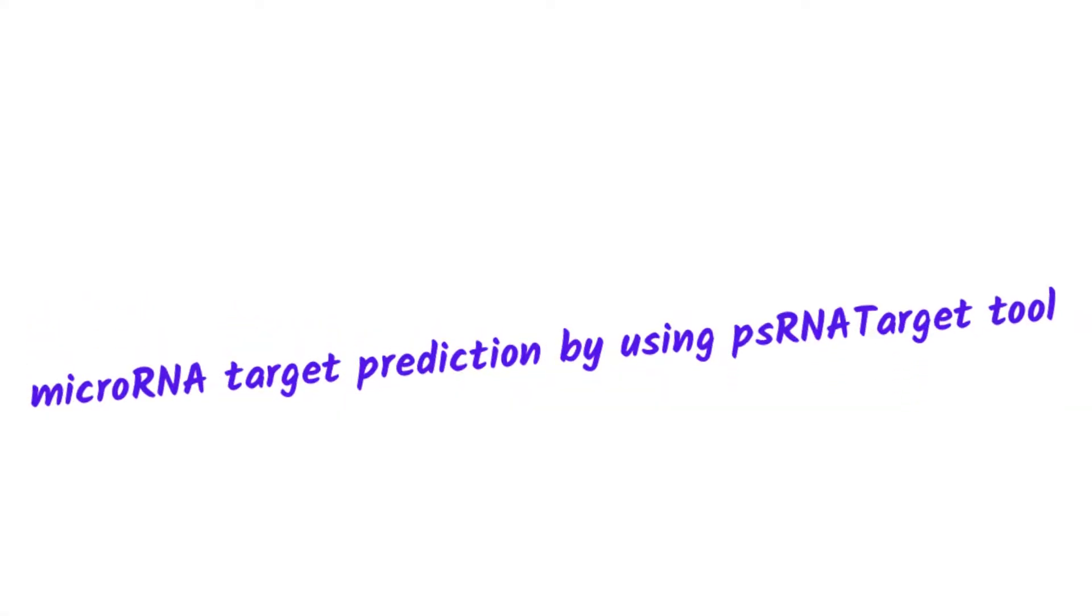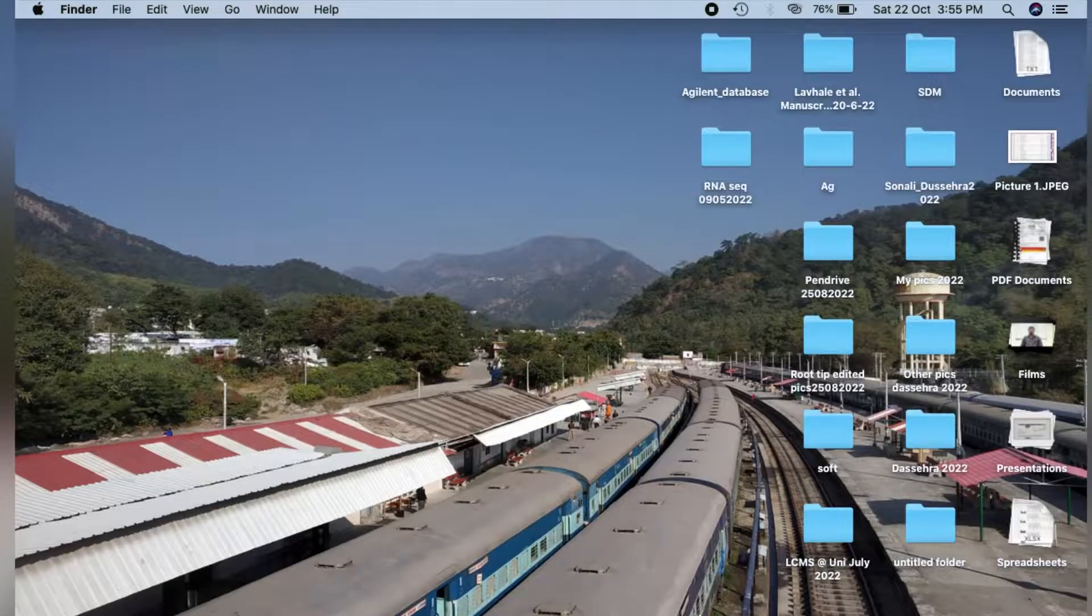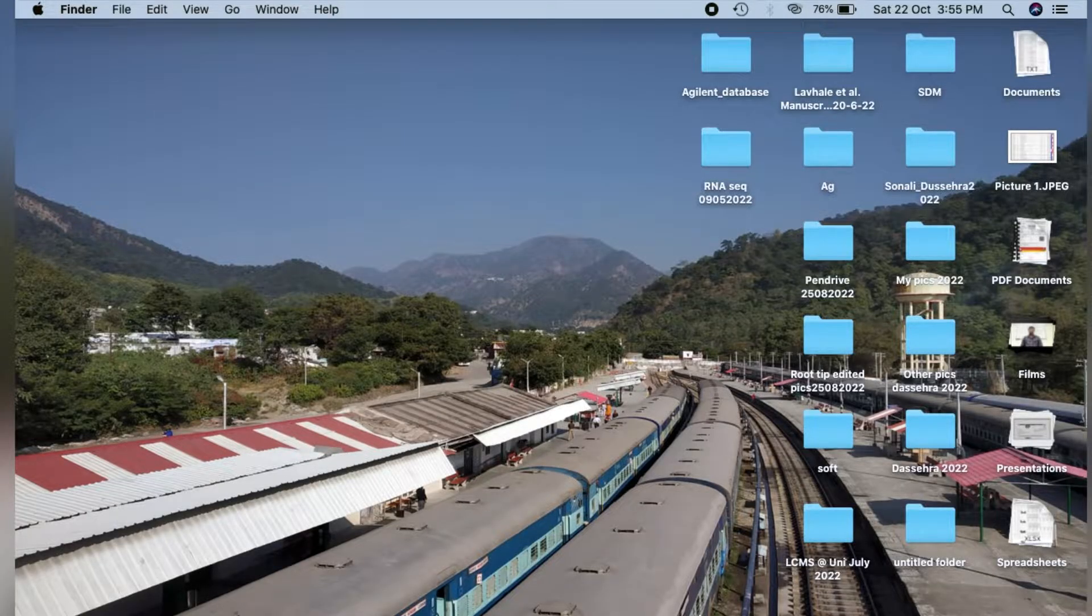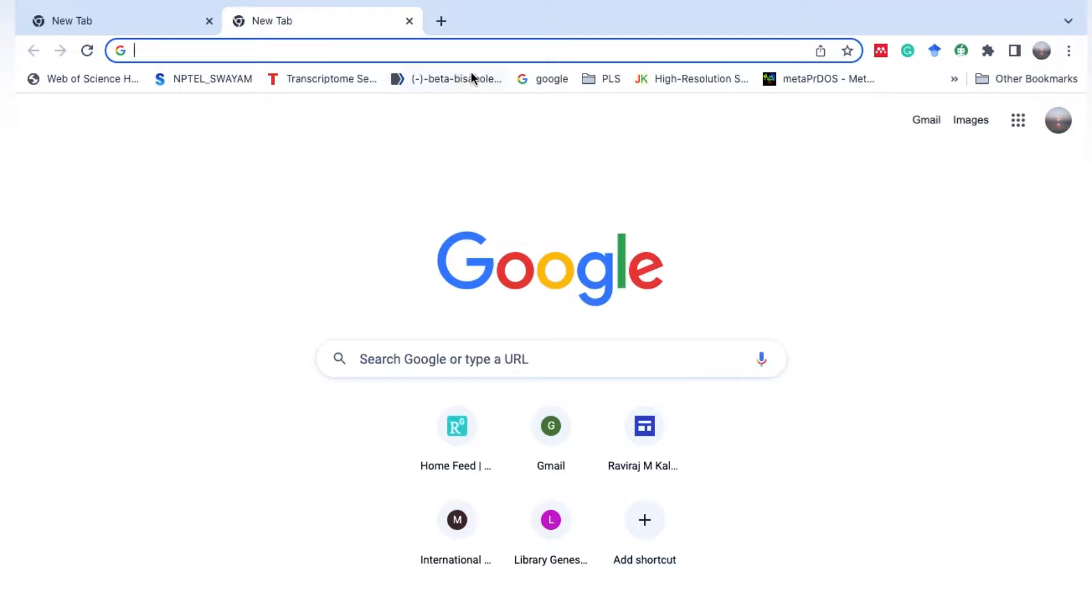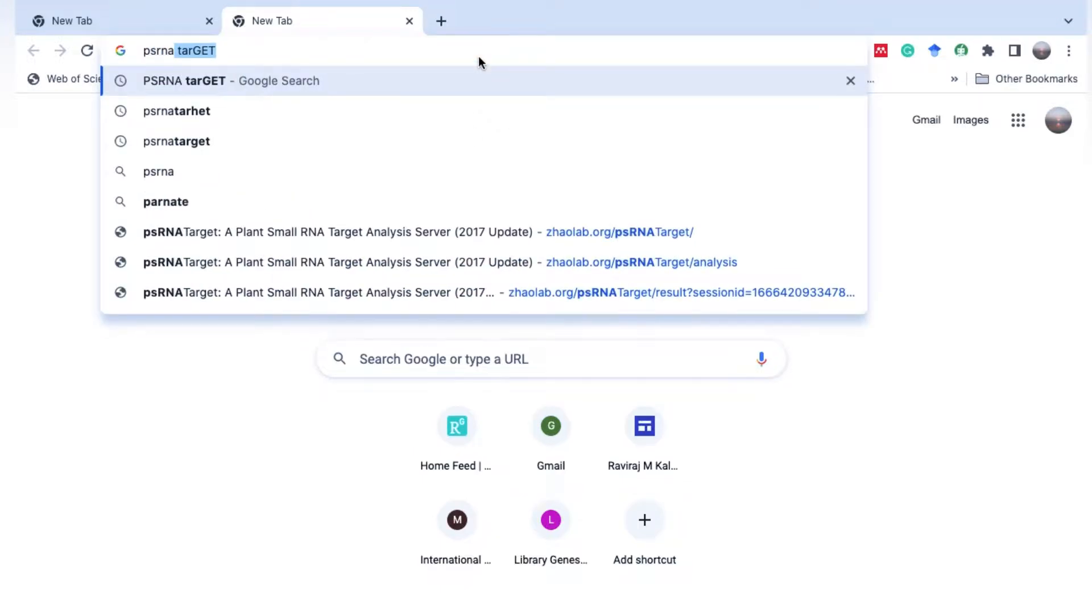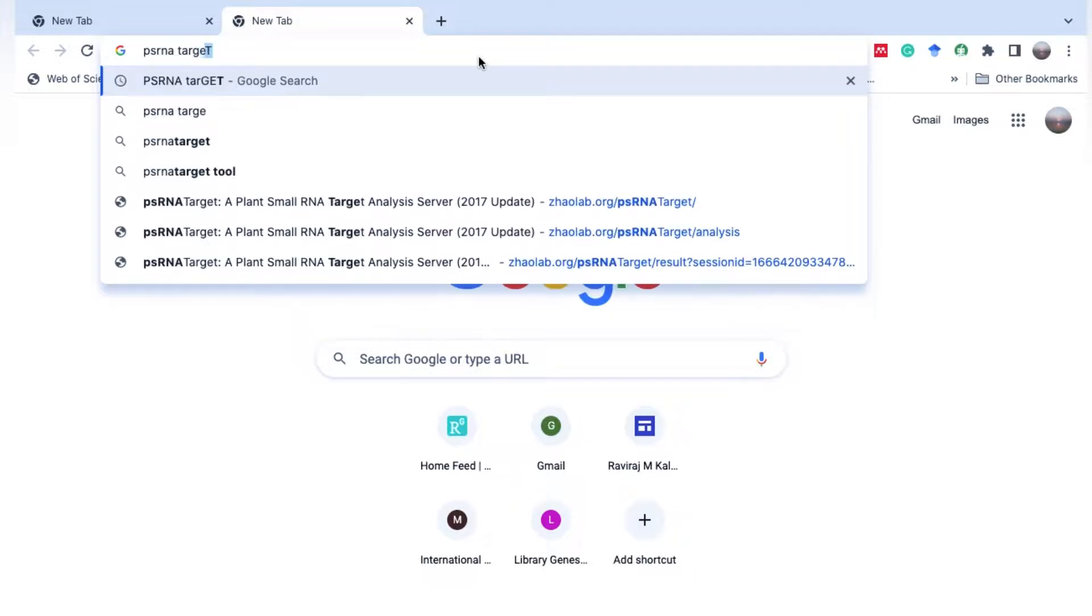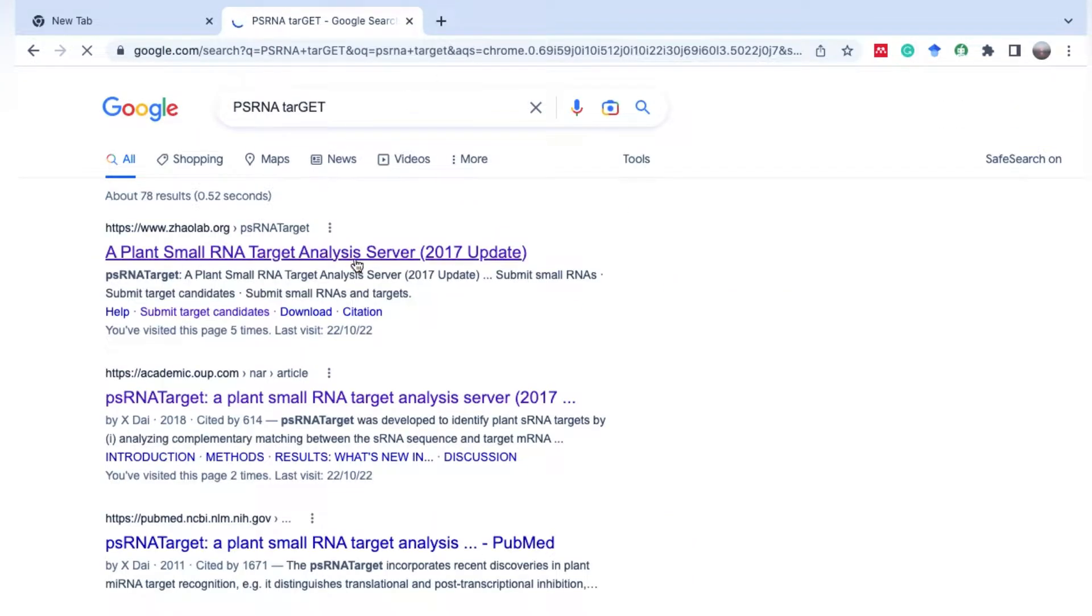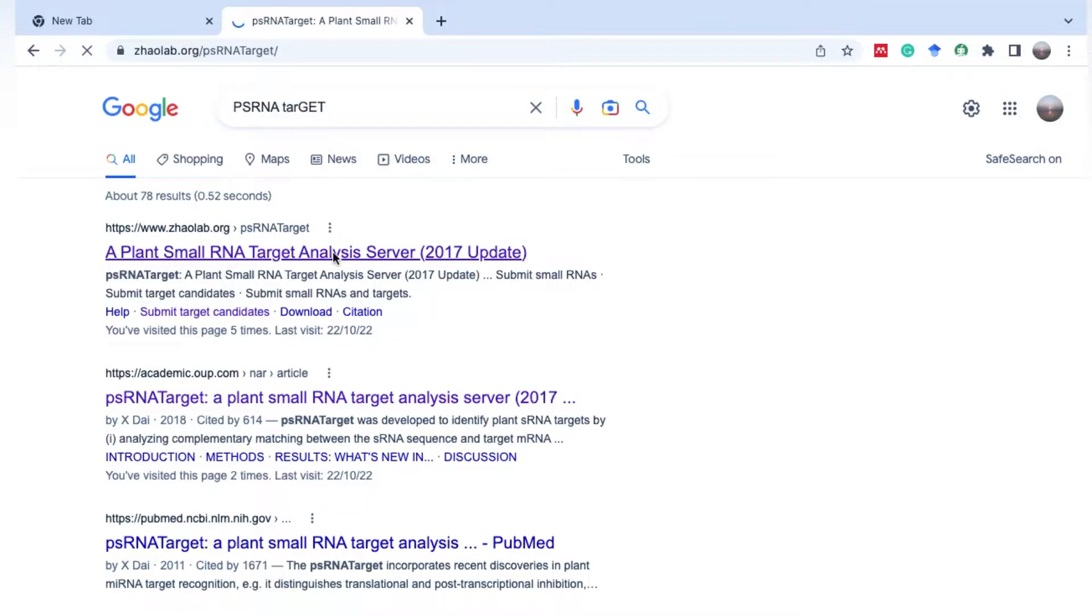Now let's start with miRNA target prediction using psRNA target tool. First you have to go into Google and search psRNA target. As you can see, this is the first result, www.zhaolab.org. This is the link for that web-based tool. You just have to click here to open this tool.